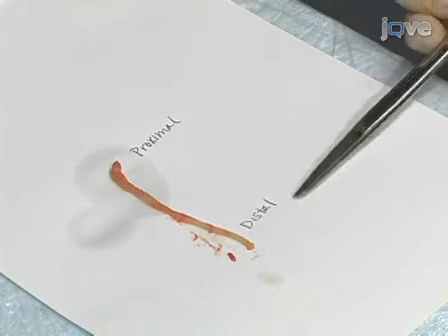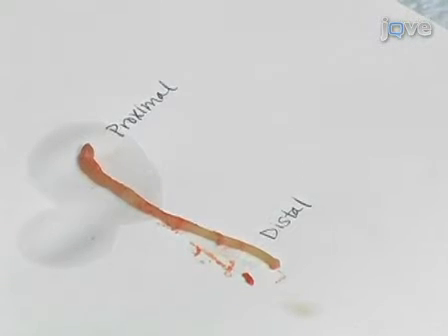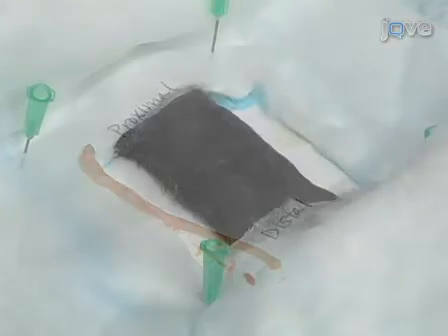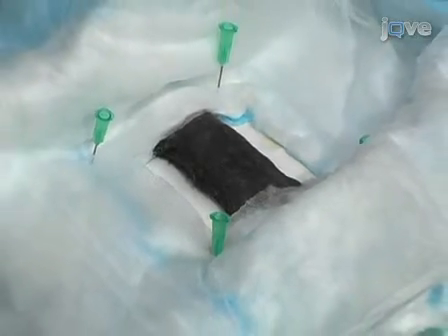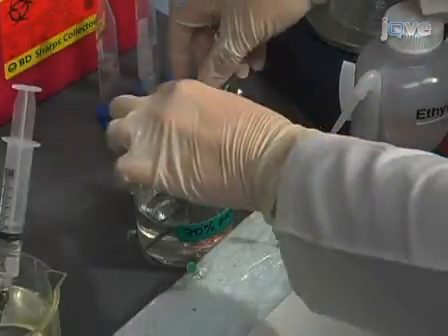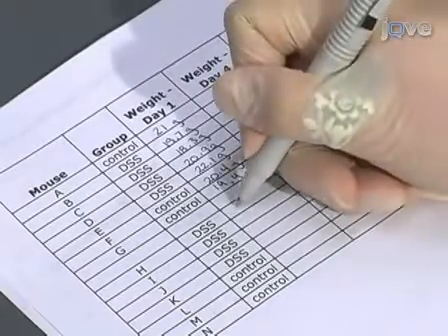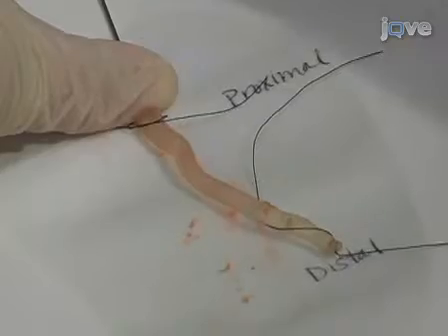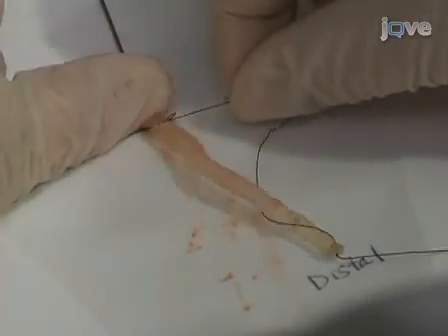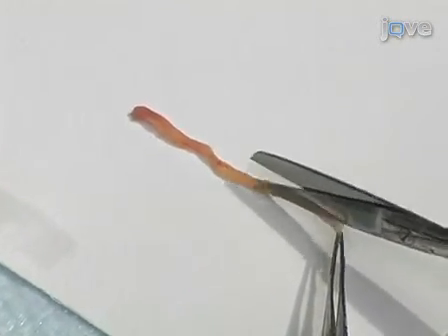We have just shown you how to harvest and process colons from a murine model of acute colitis. When performing this procedure, it is important that you are well organized prior to sacrificing the mice. For example, have all tubes and cassettes labeled for each mouse and all tools and reagents readily available. In addition, maintain detailed records of mouse weight and colon length. Finally, make sure that you have allotted enough time for processing. It usually takes 15 minutes per mouse for a novice, and 6 to 8 minutes for someone more experienced in this technique.